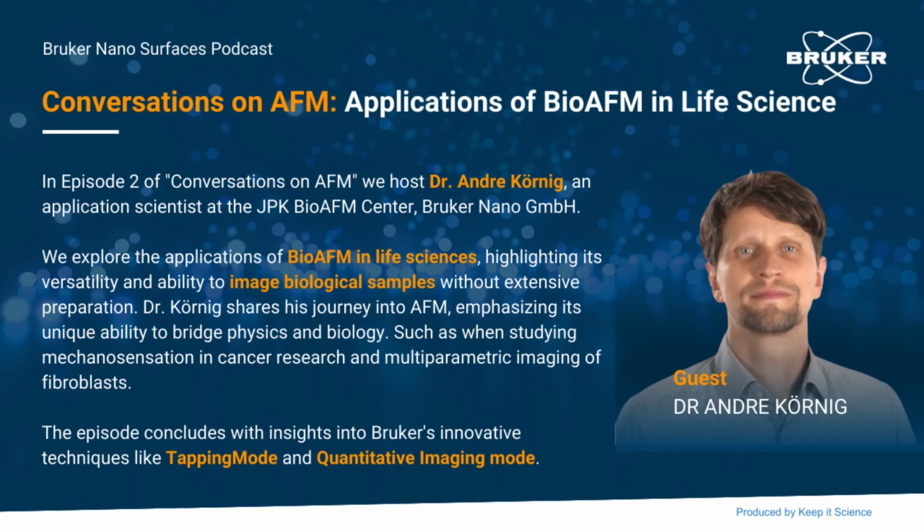So I think it was a good idea to bring this AFM technique that was traditionally more on the material side into the biological world, because it makes a lot of things quite easy to adapt, and this advantage of having it close to living conditions or native conditions is a huge advantage, and makes it easy for biologists to use it. Yeah, which is great. So it's a lot of plus points, obviously, for BioAFM.